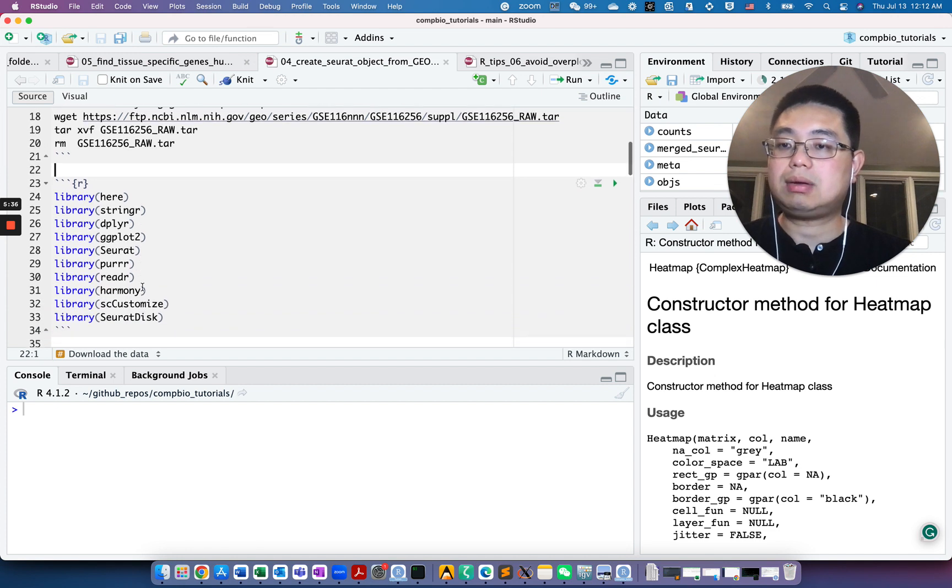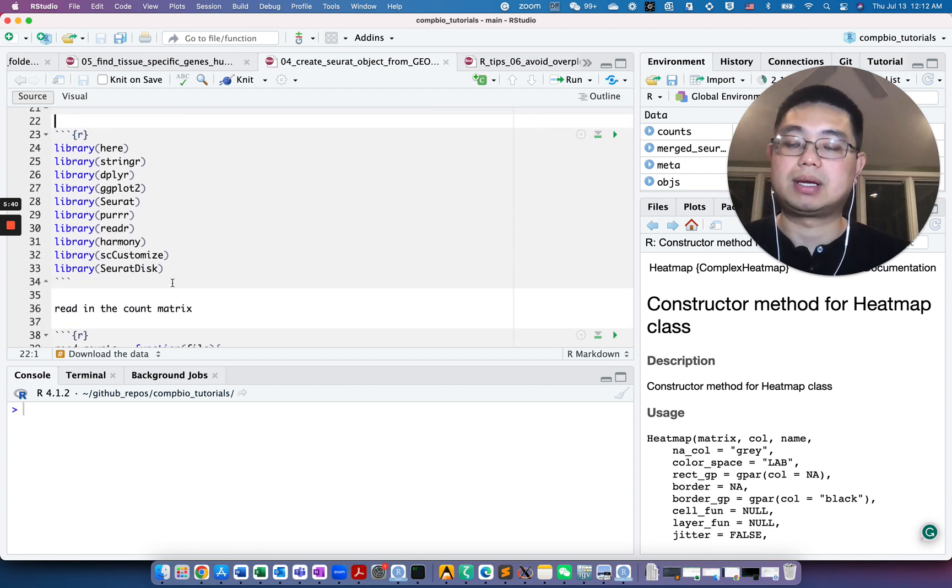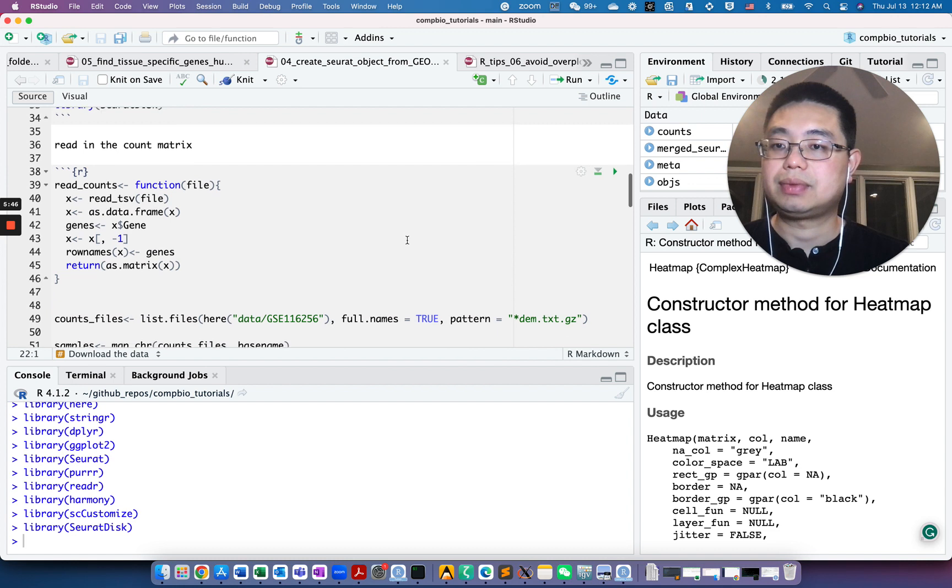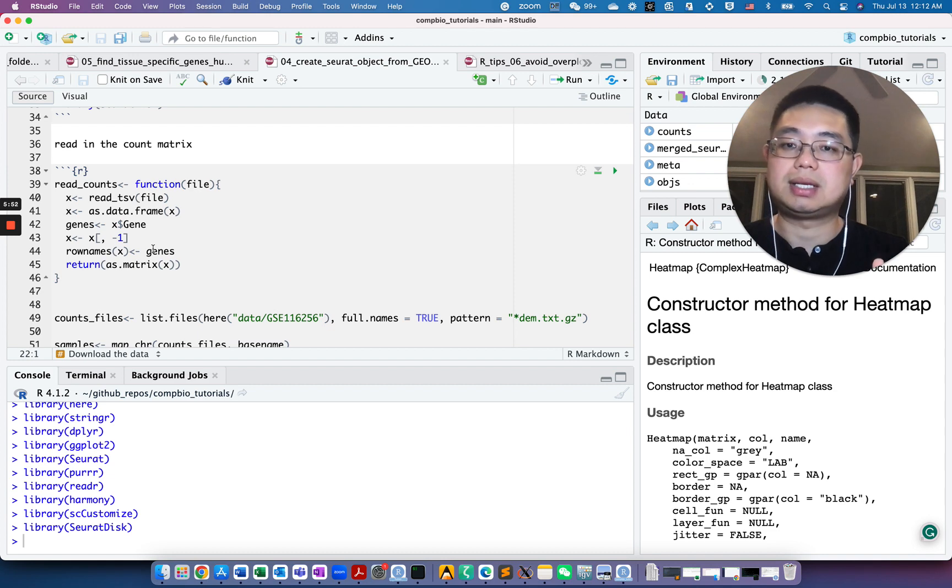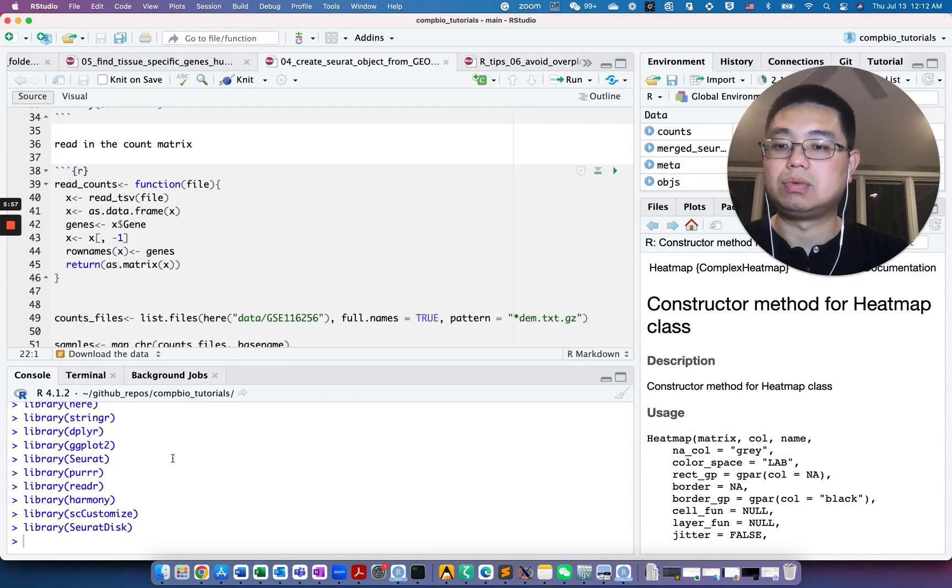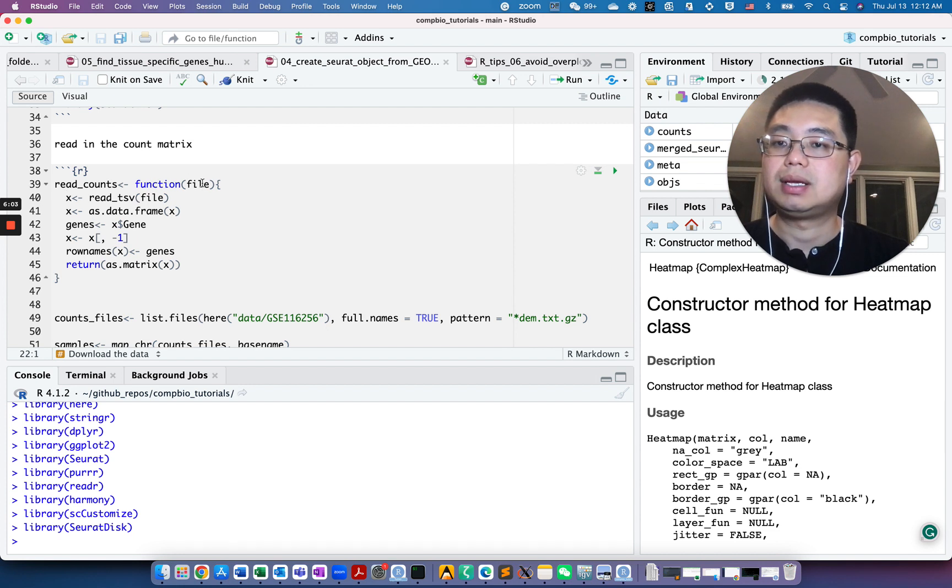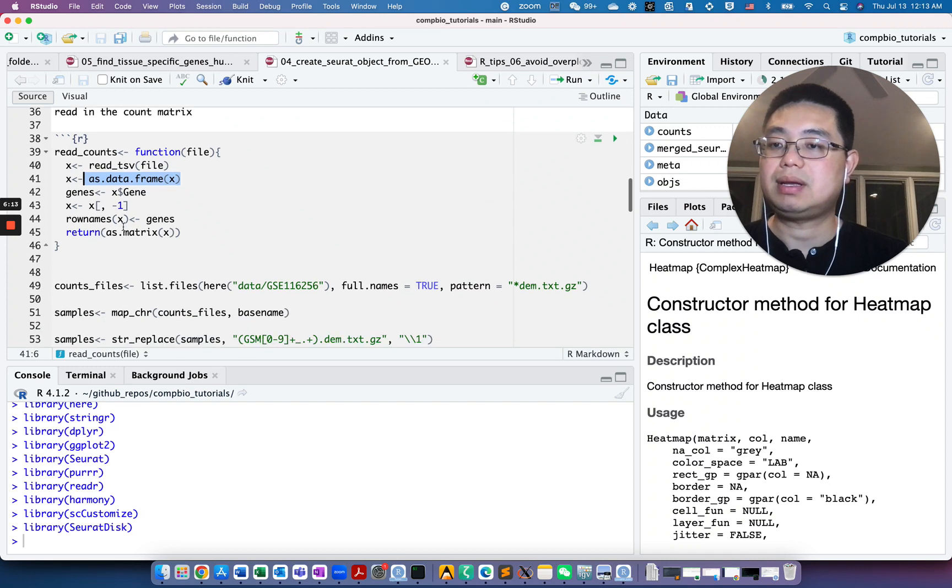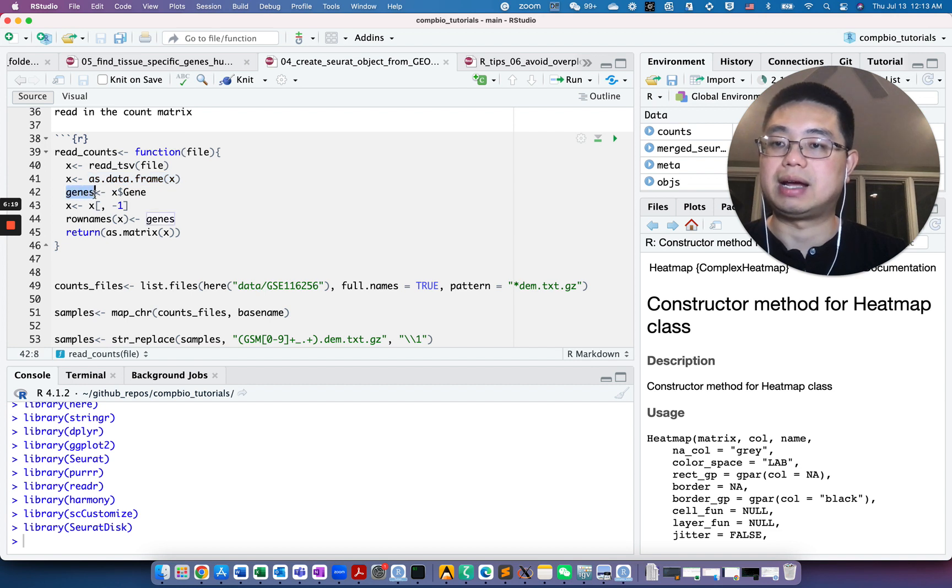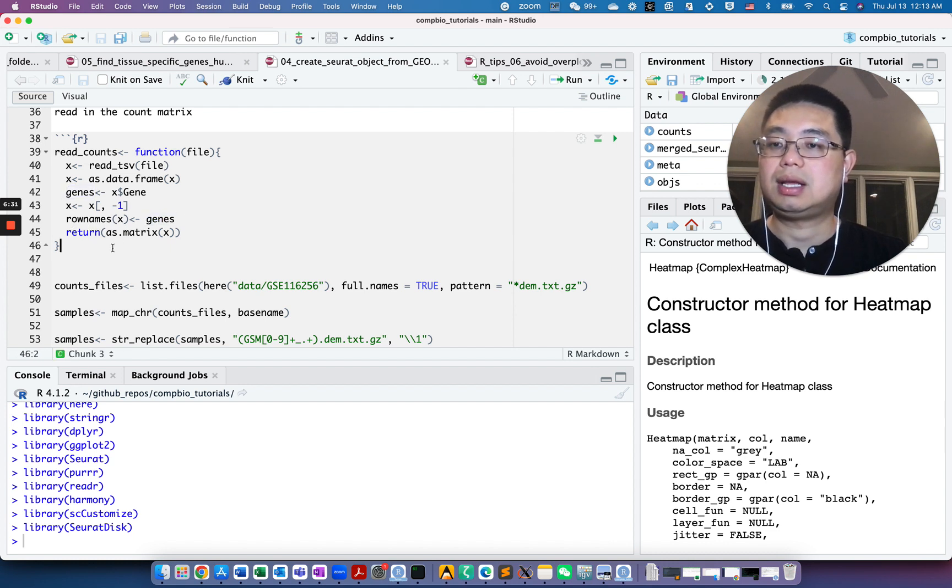Now let's go back into R and read in the count matrix and the metadata. Let's first load libraries that we need. To read in the count, to create a Seurat object it needs a matrix, but this is a data frame. We will first write a small function. File is the path for the file. We read using read_tsv to read that file and convert it as a data frame. The first column, remember, is the gene, so I take it out for now. Then I remove the first column and add all the row names as those genes and return that as a matrix.